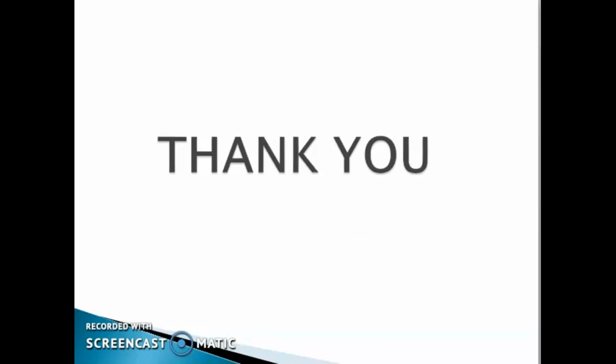Students, I hope you have understood today's practical, that is the synthesis of benzil from benzoin.